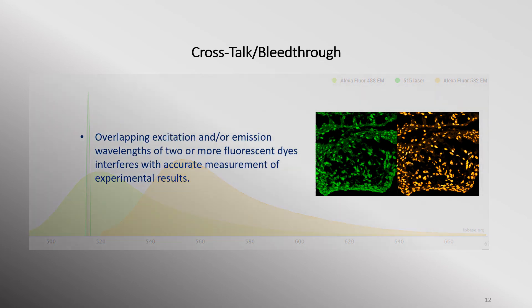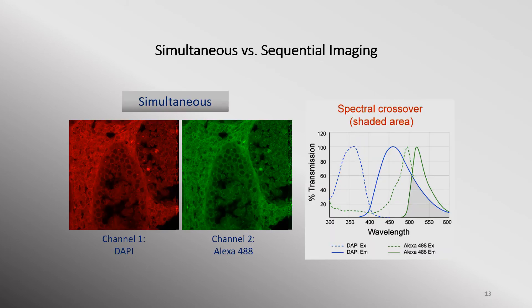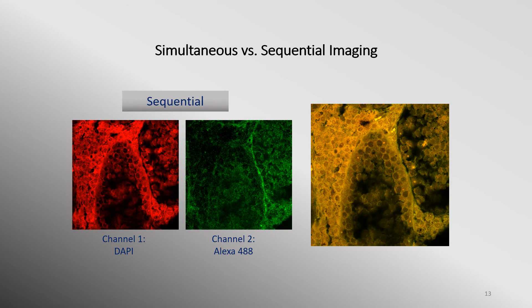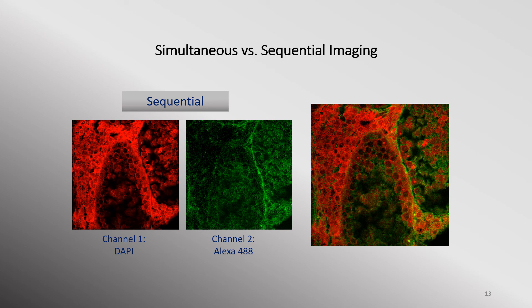Imaging with these labels diminishes the signal and interferes with the accurate measurement of experimental results. Acquiring images by the simultaneous excitation of double or triple labeled samples is a common practice, mainly because of the ease and speed of acquisition. However, bleed-through of fluorescent signals from one detector to another is common because of spectral crossover or crosstalk. To overcome this problem, image acquisition can be done sequentially. In this mode, each fluorophore is collected separately, so that there is minimal to no risk of obtaining a false positive signal in any other channel.